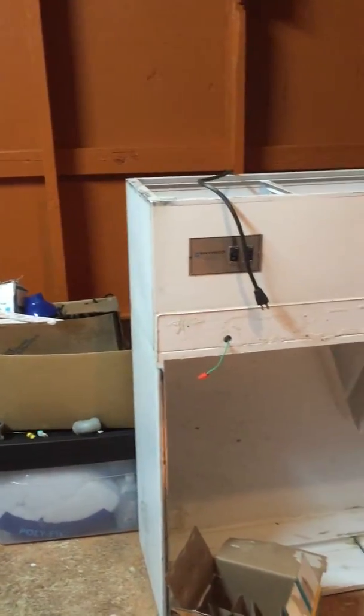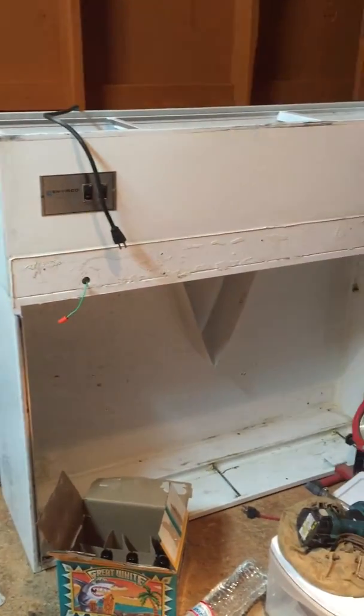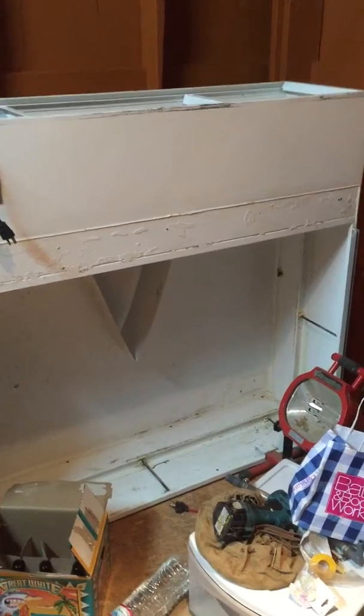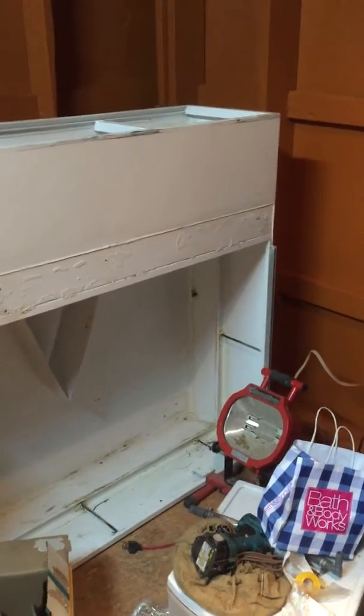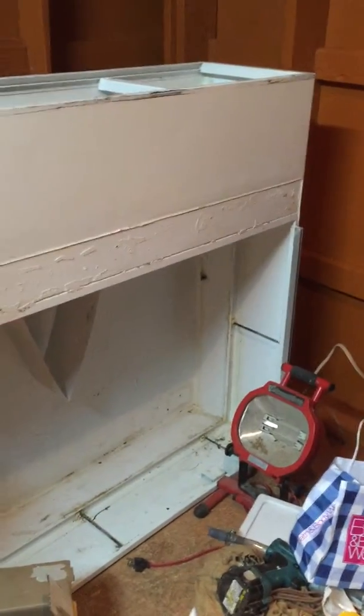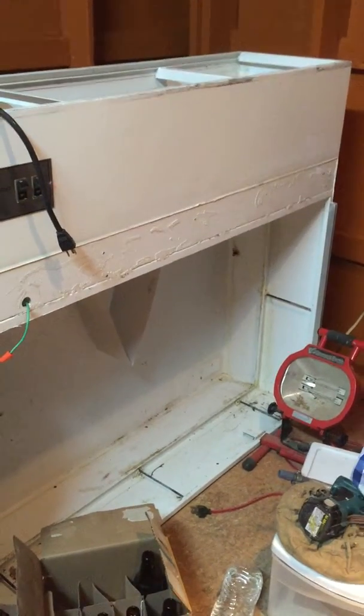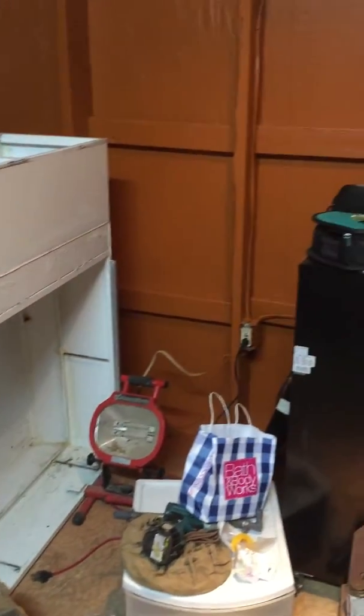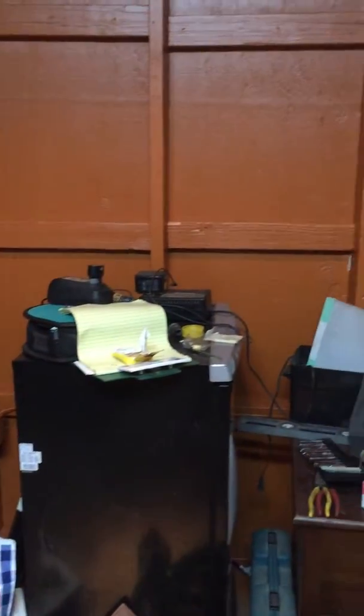Tomorrow we're going to set up the bench for the laminar flow hood here. Hopefully next week or the week after our new filter will be coming. It was quite expensive — like $500 — and that was super cheaper than any other distributors I called.